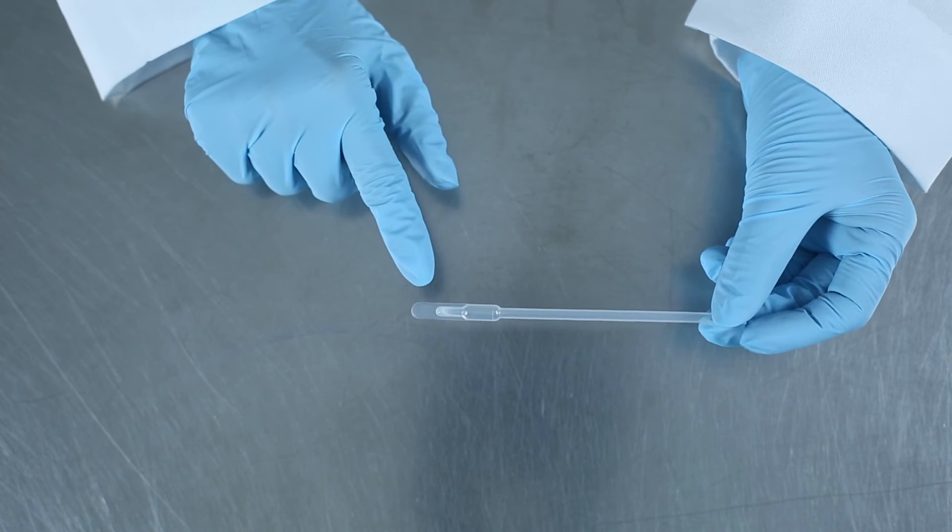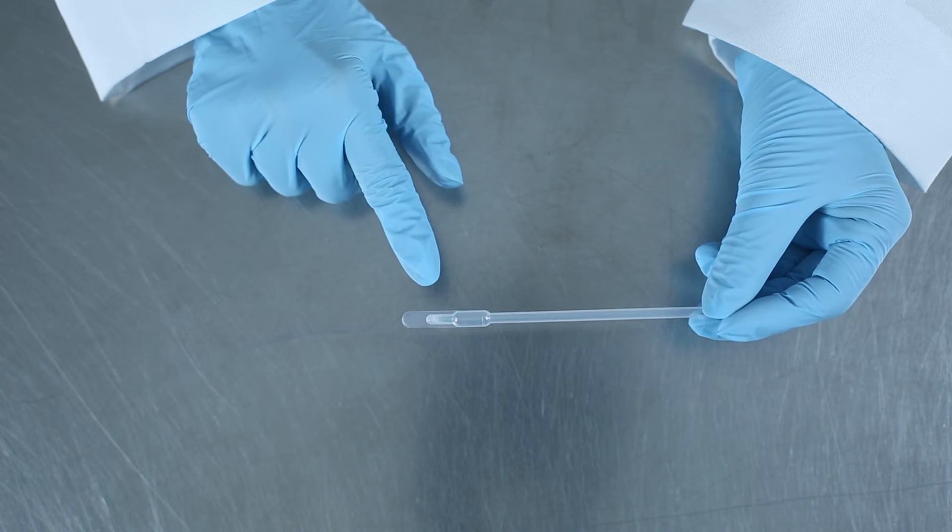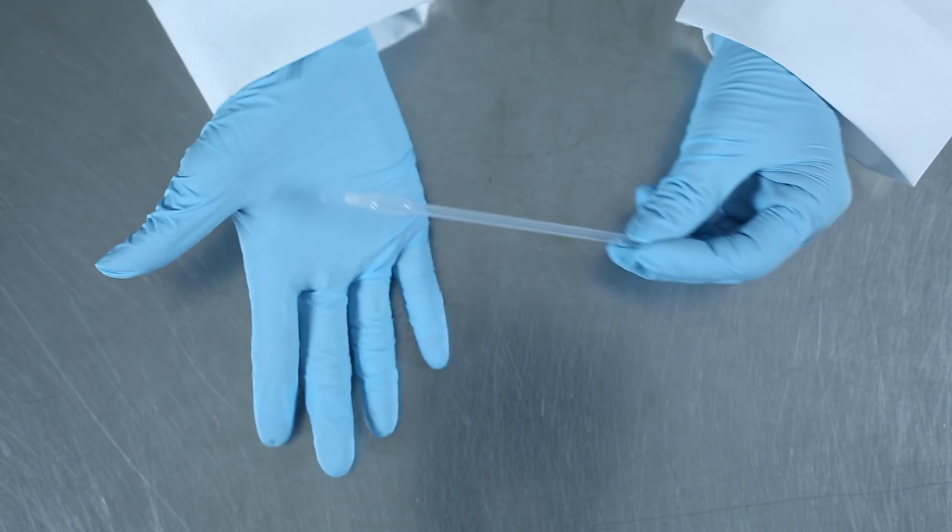Samco Paddle Transfer Pipettes are similar to general purpose pipettes but have a paddle on the end of the bulb for smearing and mixing.